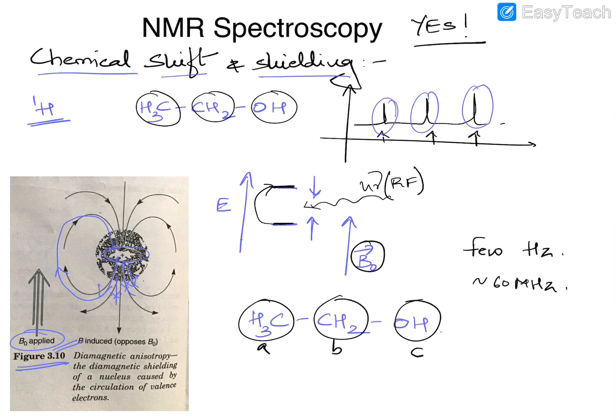If we translate this into a ratio, it works out to just a few ppm or less than a few ppm difference that results due to an enriched electron cloud around the nucleus or a decrease in the electron density around the nucleus.